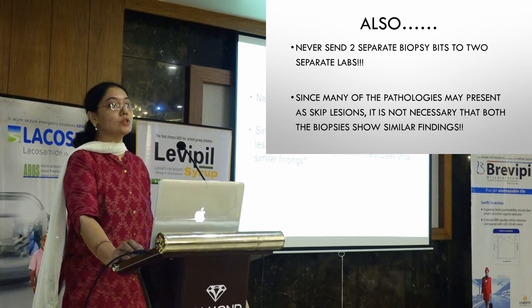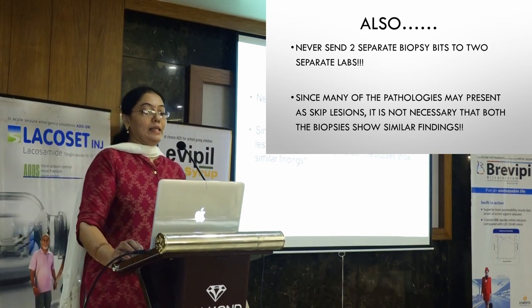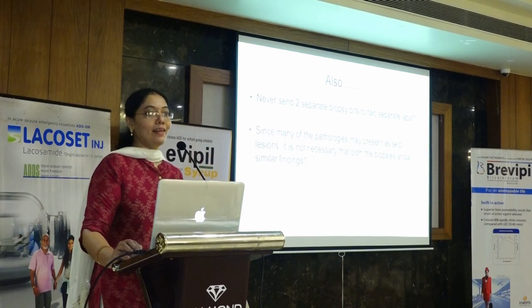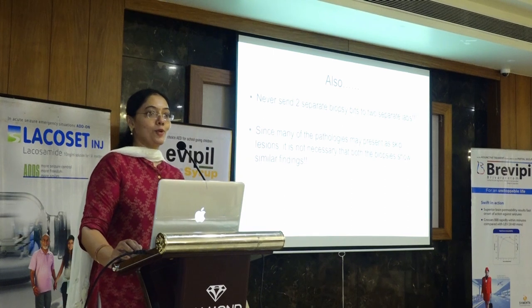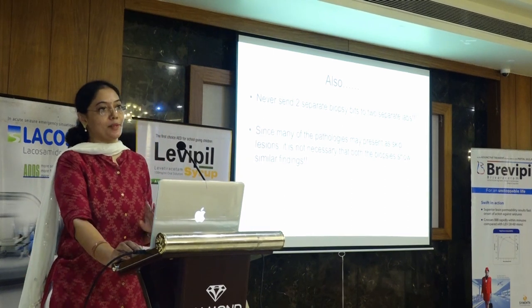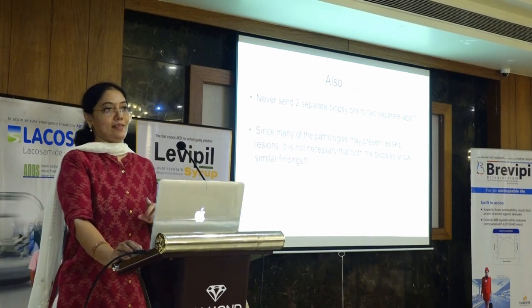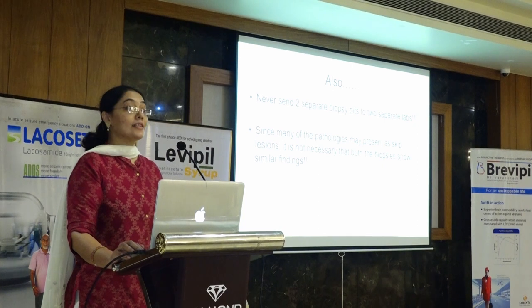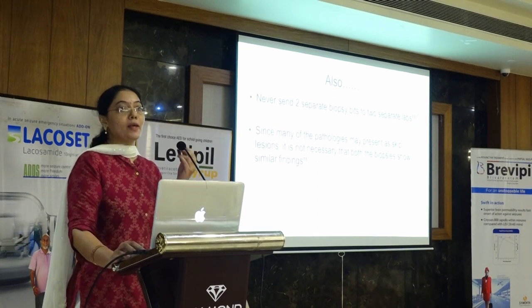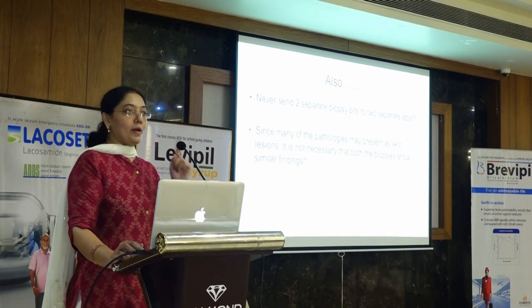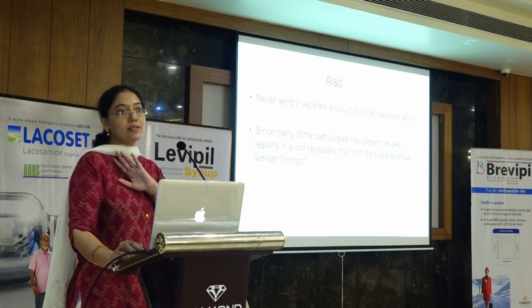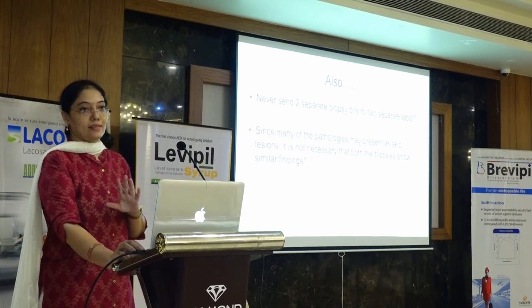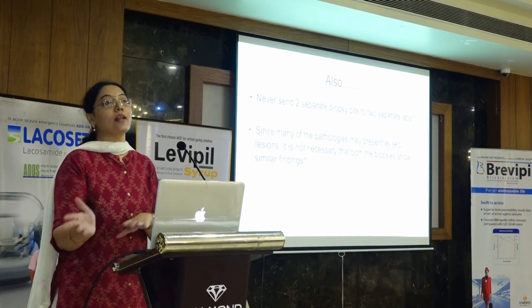Never send two separate biopsies to two separate labs. One biopsy will report a finding and the other lab will report no diagnostic pathology — it is not the mistake of the pathologist, it is the tissue that was sent. Instead, send one biopsy and get a second opinion by sending the same biopsy elsewhere. This did happen once — we had two nerve biopsies sent to us. One had frank vasculitis; the other, except for myelinated fiber loss, had nothing else. Had I received only the second one, I would have told chronic non-uniform axonopathy. But since vasculitis was present in the other bit, the diagnosis was vasculitic neuropathy.